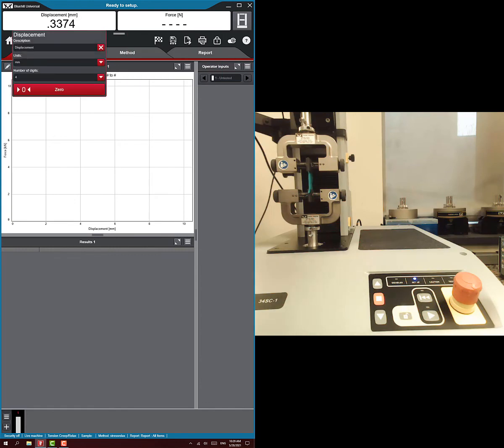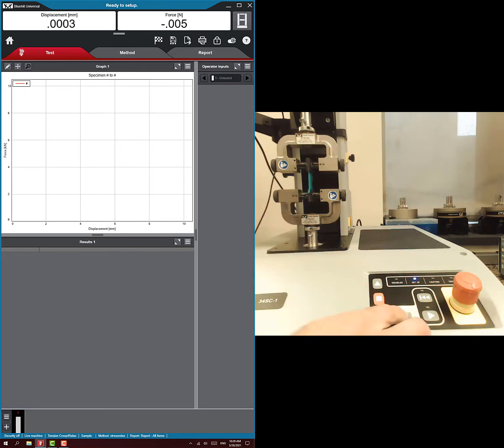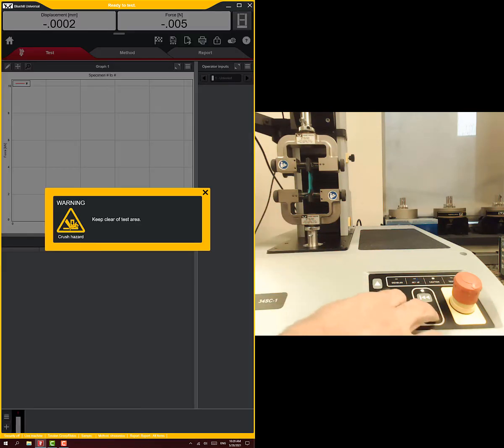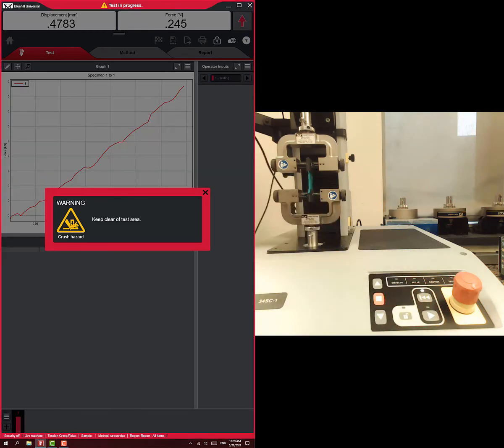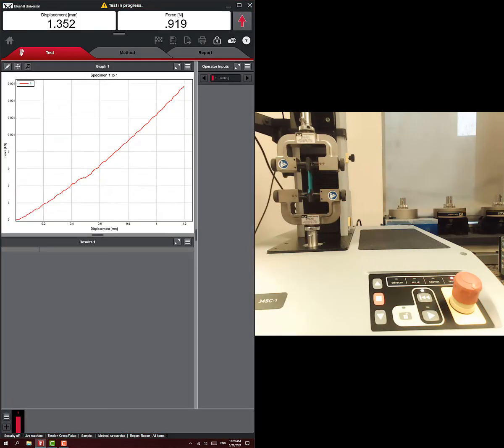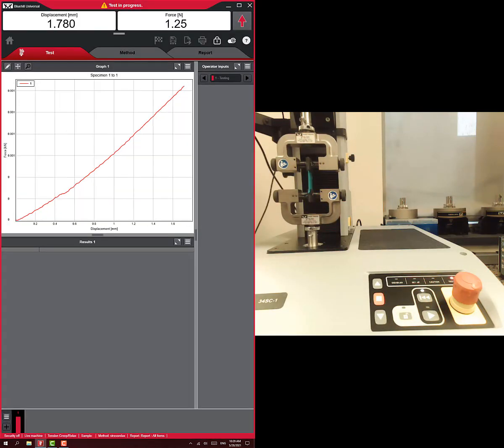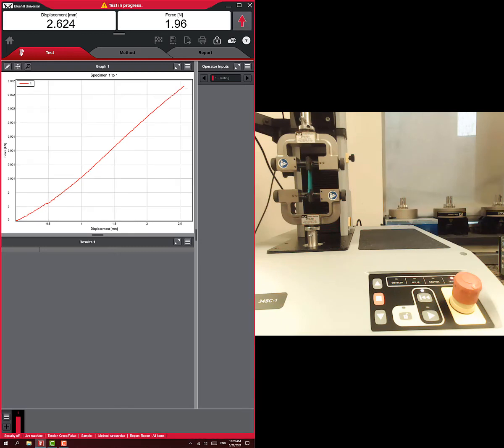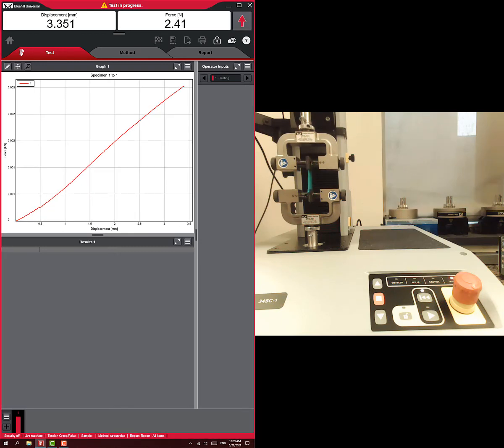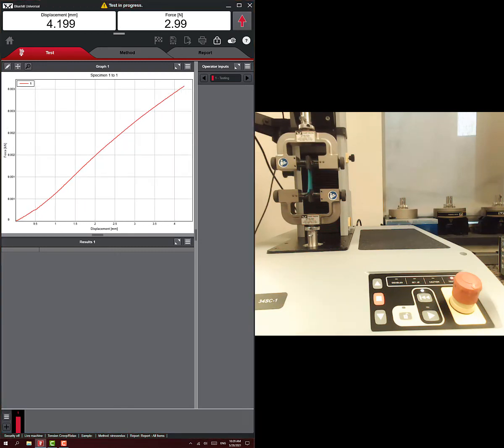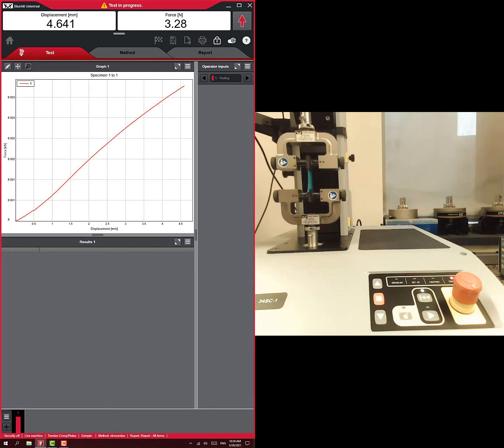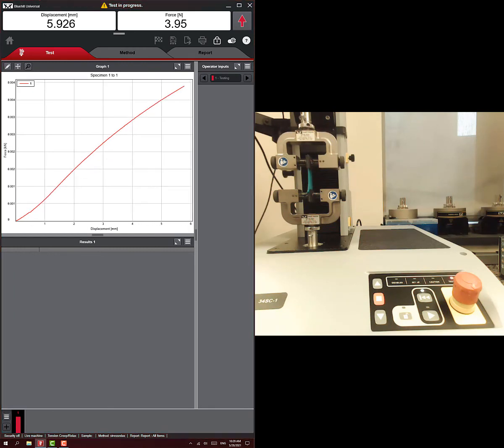Zero out the displacement as well. And now we're ready to run our test. Very easy to run the test again. Just unlock, play, and it will start running. And so it's pulling at 25 millimeters a minute. When the displacement gets to 10 millimeters, it will stop and hold for 20 seconds.